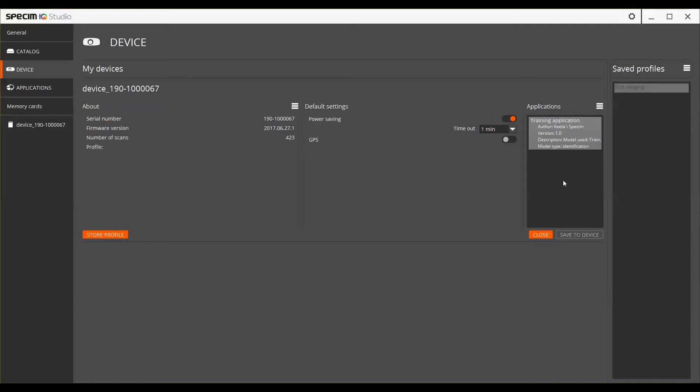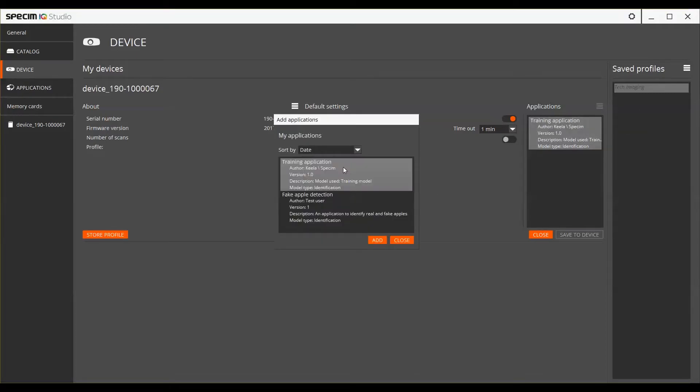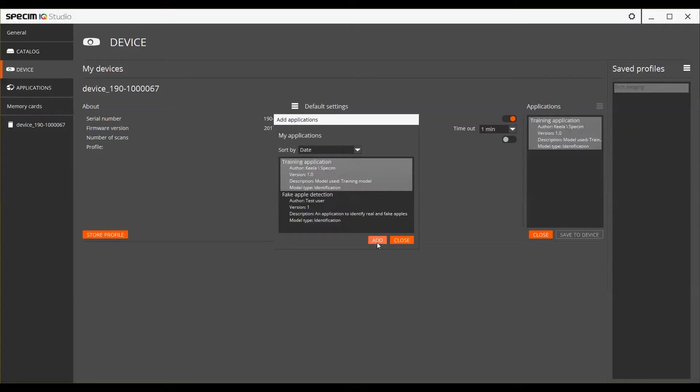To add an application, select Add from the burger menu, choose the desired application and press Add. After this, make sure to press Save to Device.